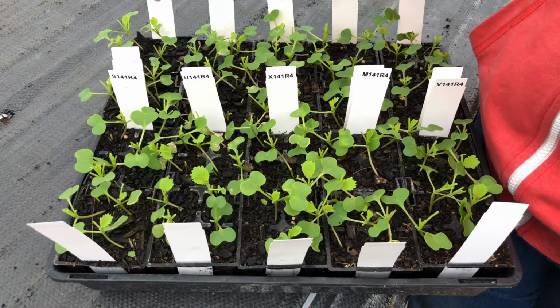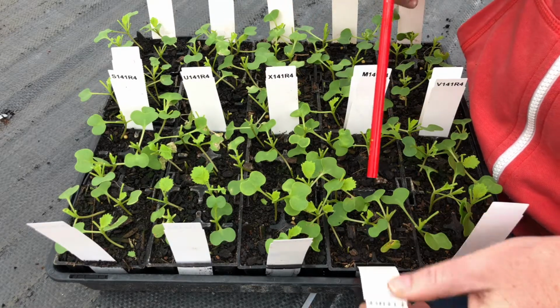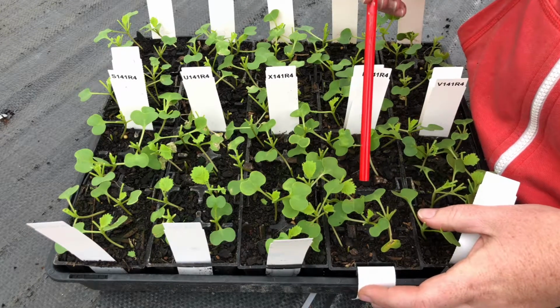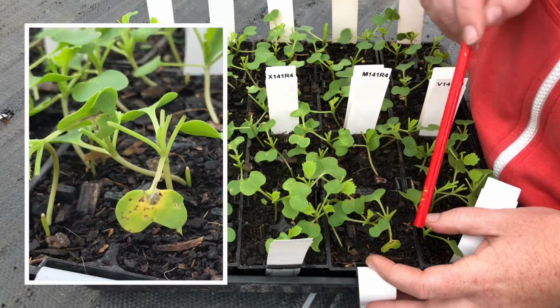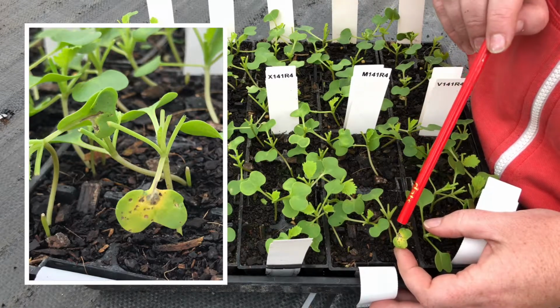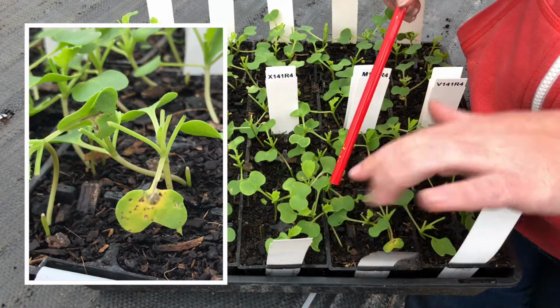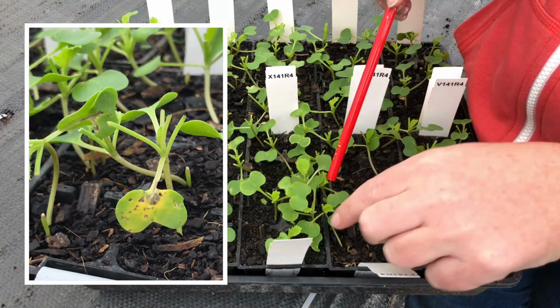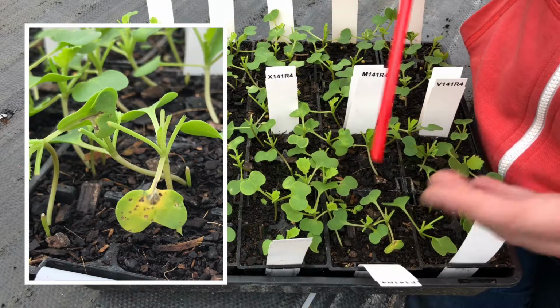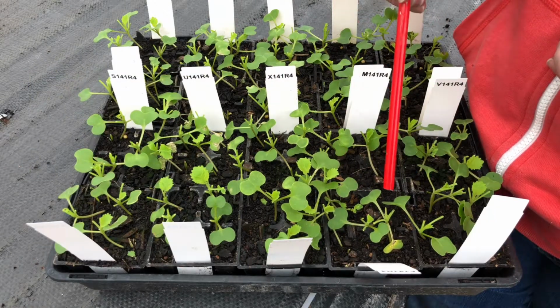We then come to our DMI fungicides. For example here, these 4 plants are an example of our flutriafol, which is the fertilizer amended fungicide. And you can see you've got colonisation going on here. The petiole is actually collapsing. Here's another lesion here. This plant under here is also completely colonised. So you're seeing fungicide resistance in this example.